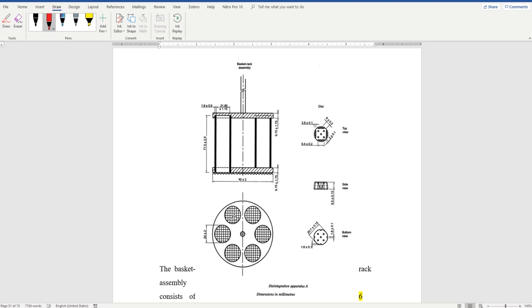So when you press at them, you will feel that they are soft, easily compressible between fingers. If they are firm and dry from inside, then this means that the tablet did not pass the test. So after, let's say, 15 minutes, I want you to check the condition of each tablet. If any fragments remain, they should be soft and small.